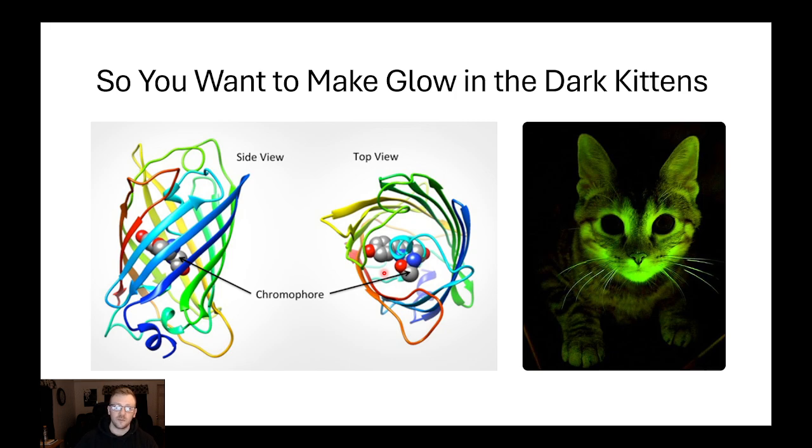And it's this chromophore that is going to actually absorb a photon, undergo a Stokes shift, and emit a photon inside of that beta barrel. This is the functional business end of this molecule. And we can do this for multiple different wavelengths of light, which I'm going to show you later. But the most powerful aspect, I said this is probably the most revolutionary thing to have ever happened in microscopy. The reason that this is so powerful is, one, we can start to get specificity on what we're imaging. If I want to see one specific protein, I can label it with a fluorophore, and I can look and only see that color of light as I demonstrated on the previous slide.